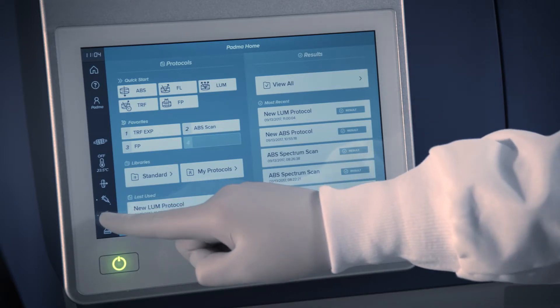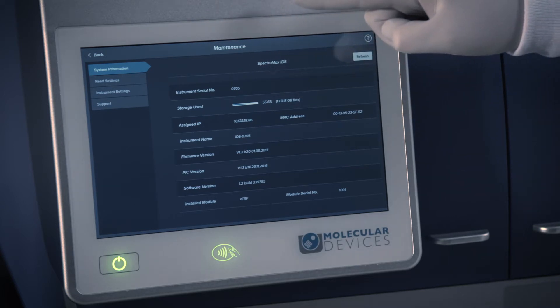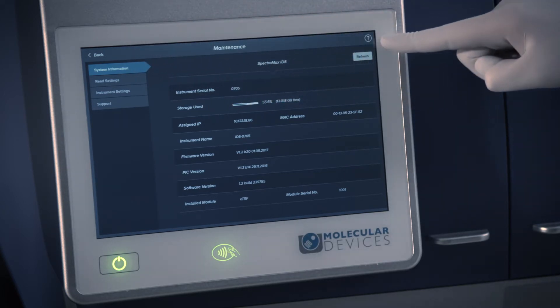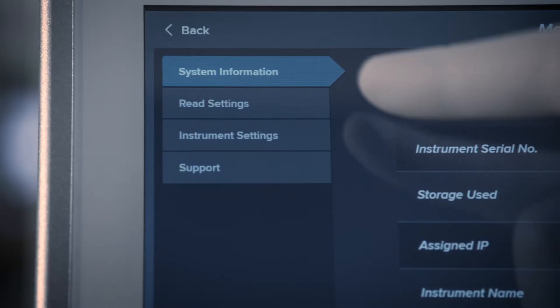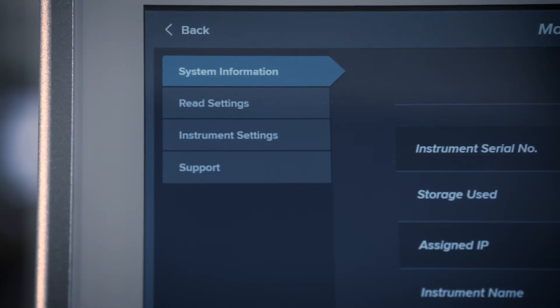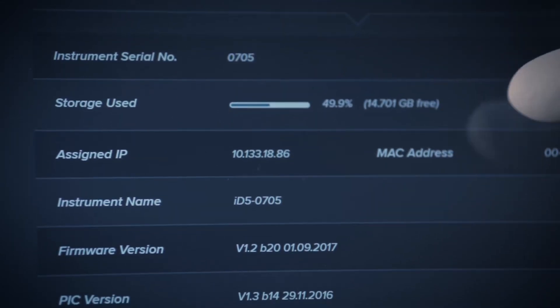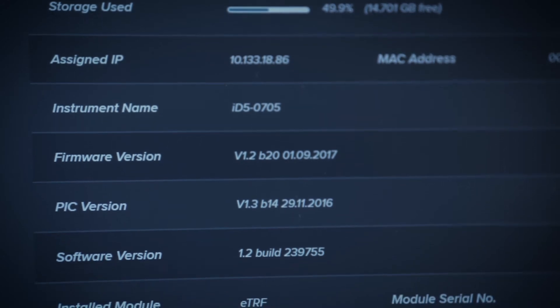Touching the wrench icon will bring you to the maintenance page. When viewing a subpage, the back button will bring you back to the previous page and the help icon is now in the upper right-hand corner. In the System Information tab, additional information about the instrument is displayed, including the instrument's serial number, amount of data storage used, firmware information, and IP address.